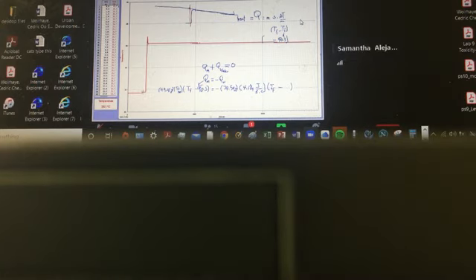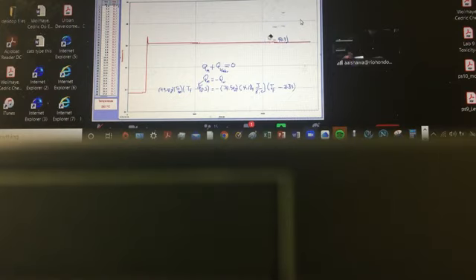Can you look at 21.85? Right. So 21.85. So I'm going to write down 21.85. So that was the initial temperature. The final temperature is coming up. Okay, so let's erase and try to analyze. Let me show you how to analyze the final temperature. Very simple.